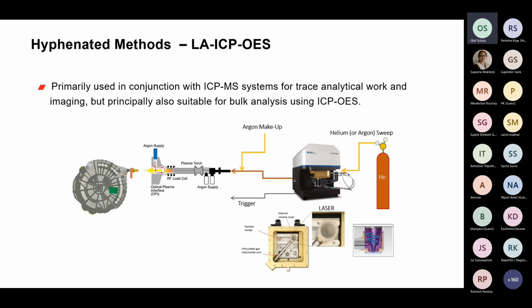Yeah, quite popular in research, combined with ICP-MS, a small spot laser with an automated XY stage and a magnifying camera system. It enables the spatially resolved analysis of the sample, and this is really the perfect research tool.